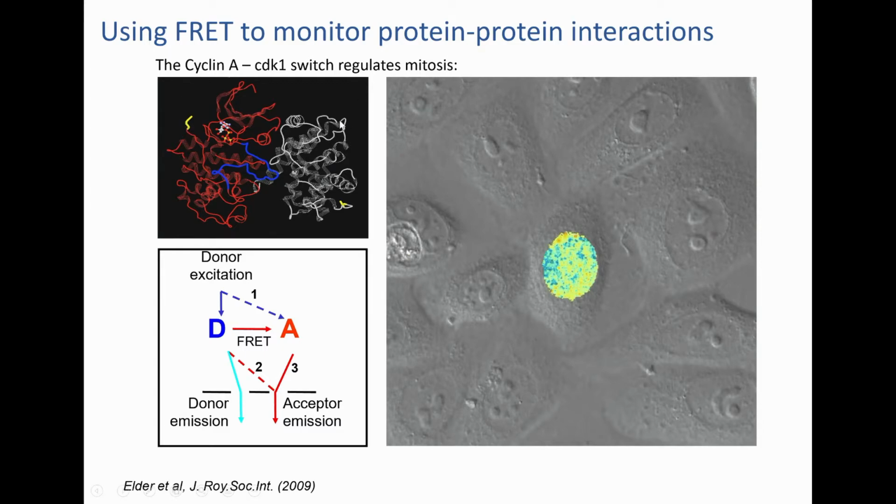So these are cartoons of what these proteins look like. And so at the end you see these yellow tails, and these are a donor molecule that we've attached to the proteins using this fusion protein technology that I've already talked about. And so we have a donor on this molecule and the acceptor on the other molecule. And then inside the cell, these come together, and you will see how the FRET signal increases as more and more of the molecules bind, and then at the peak the cell will start to divide, and at that point the signal goes down. And so I don't want to give you all the details, it's too much, but you can see that you can get molecular level information.